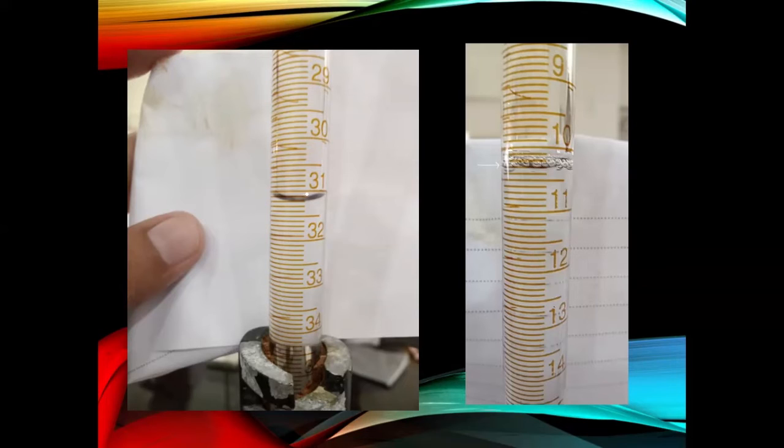So it is 31.1, and this is 31.2. So 31.2 is this reading. Although we can read this one as well, this is 10, 10.1, 10.2, 10.3. So this reading is 10.3. No problem, although we can read it, but the bubble should not be there because it may cause a slight difference in your readings.